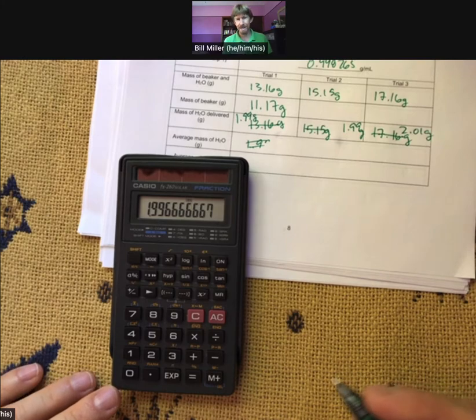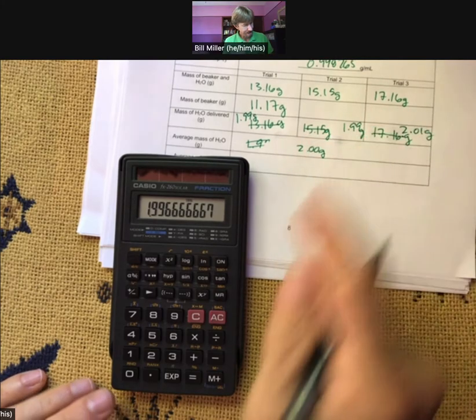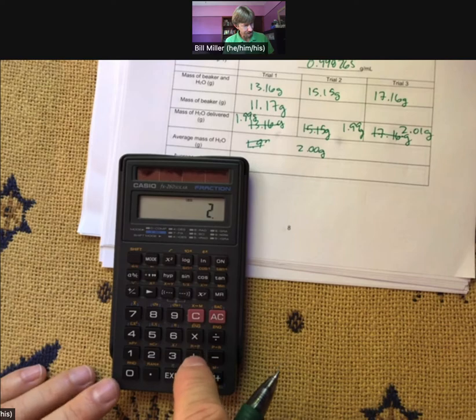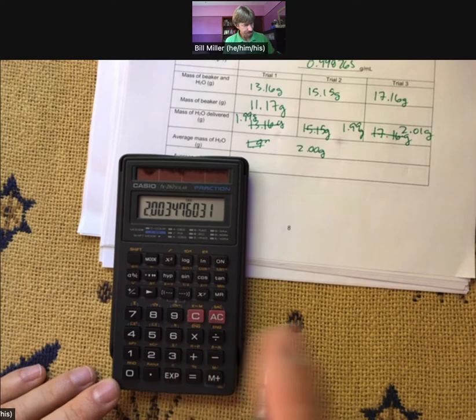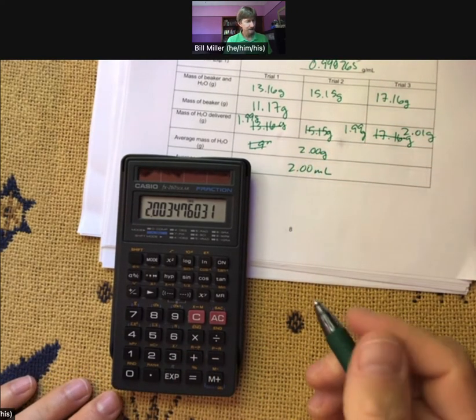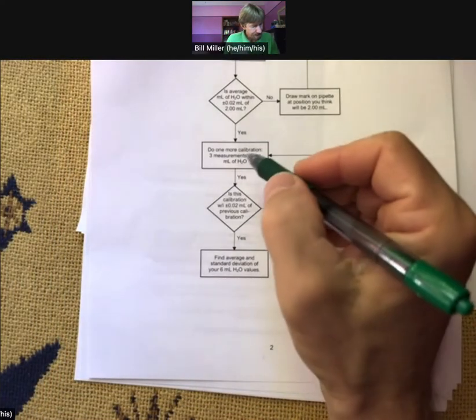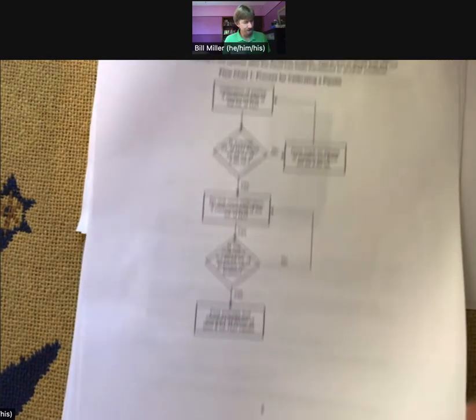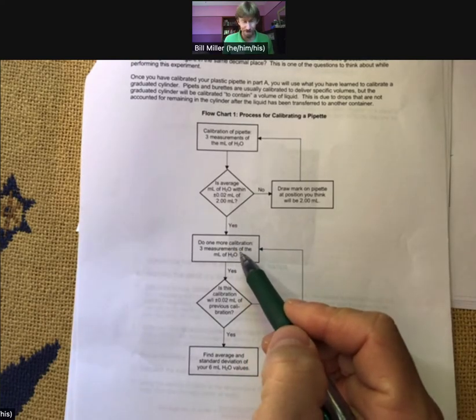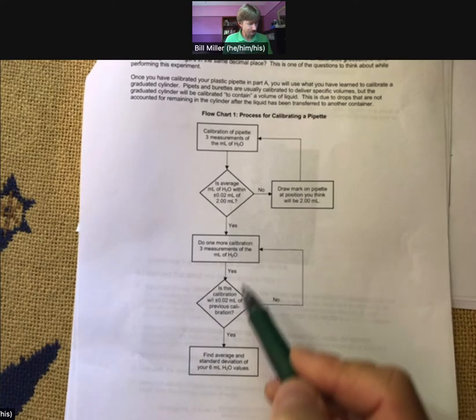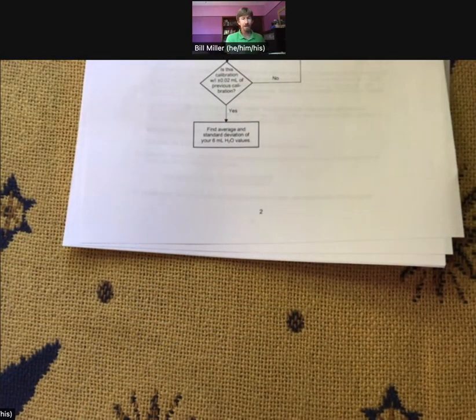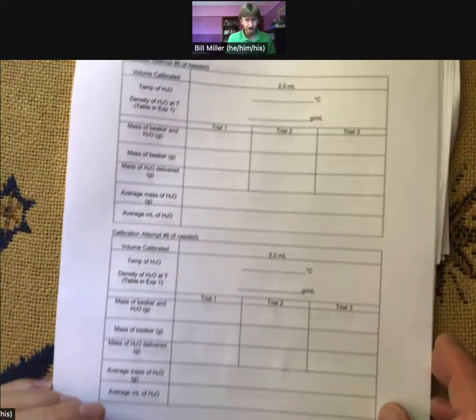The average is 1.9967, which rounds to 2.00 grams, and 2.00 divided by the density gives 2.00 milliliters. After four attempts I finally got one within plus or minus 0.02 milliliters. According to the flow chart: is the average within ±0.02? Yes — so do another one to make sure it's reproducible and wasn't a fluke. My measurements have been pretty precise, so hopefully that'll happen again.